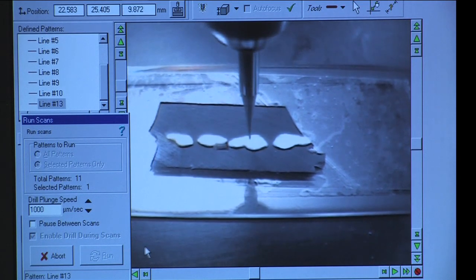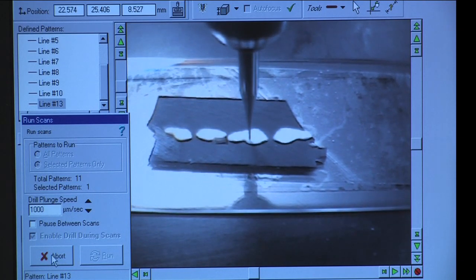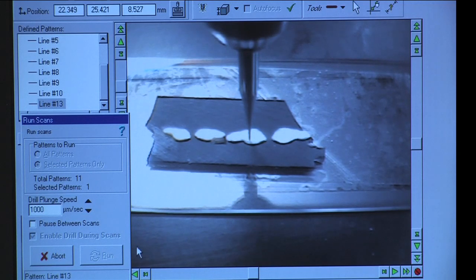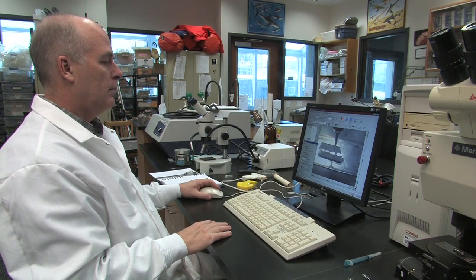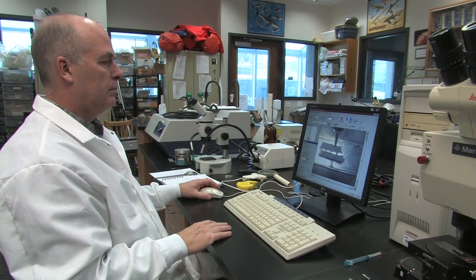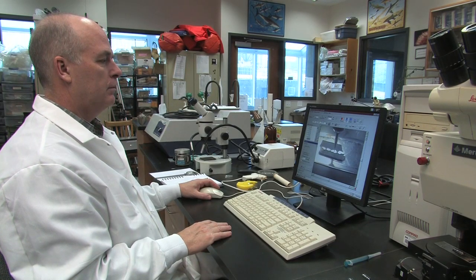You can abort the drilling process at any time by clicking Abort on the screen or using the Kill Abort button on the Micromill. The Kill Abort button will stop the drill immediately but you cannot pick up where you left off. So you would have to note which pass you were on before hitting the button and start over.